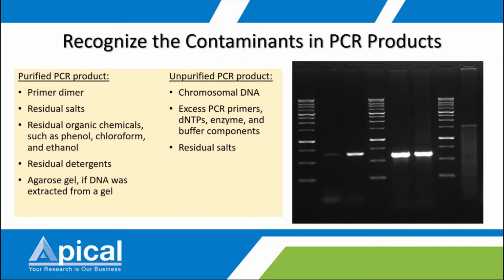For PCR product, the most common contaminants that you can find, the invisible ones, may be organic chemicals, salt from the buffer, and excess PCR primer. Excess PCR primer will give you noise in your result.